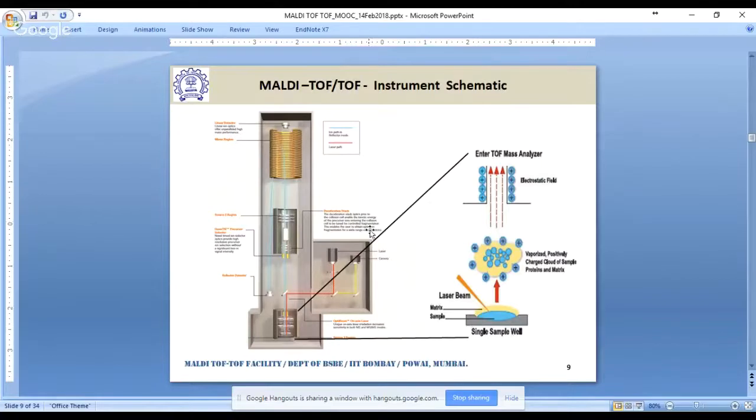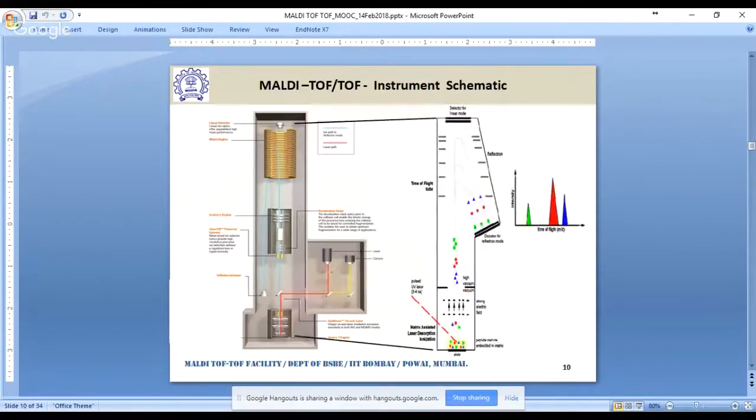into the vacuum tube. Here there is another detector placed over here, and since these are the reflected ions that are being detected, the detector is called the reflectron detector, and the mode of detection is called the reflectron mode. So this is better exemplified in this particular slide. This would be the linear mode of detection, detected with the help of this detector at the top of the instrument. And for smaller molecules, we have the reflectron detector over here.